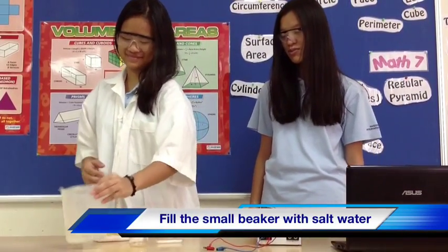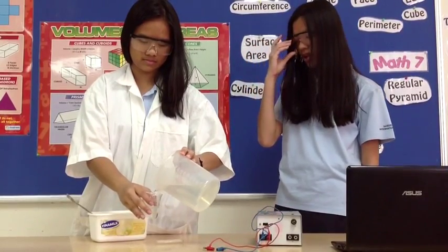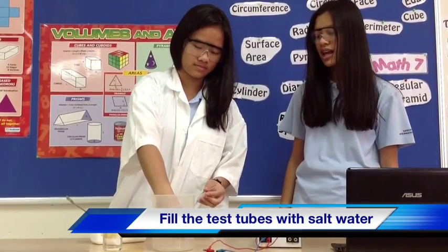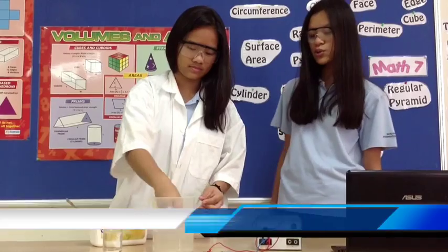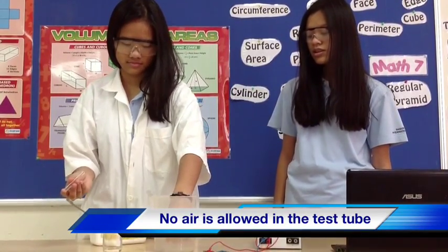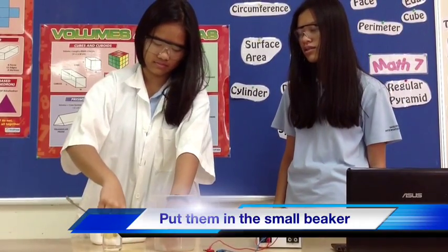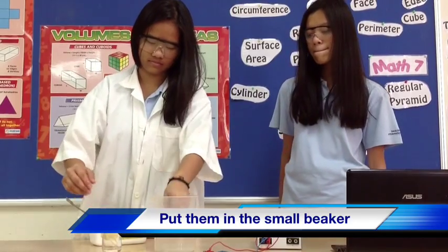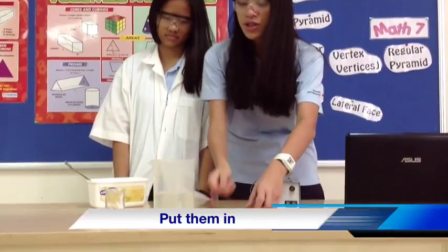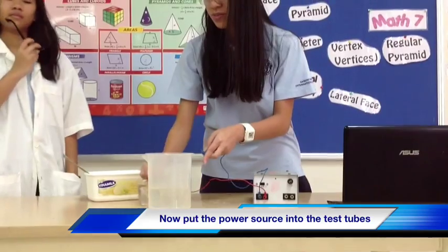Fill the small beaker with salt water, and fill the two test tubes with salt water too. Air cannot go into the small test tubes, so put them in the small beaker.